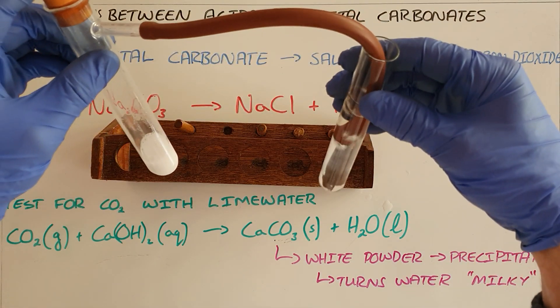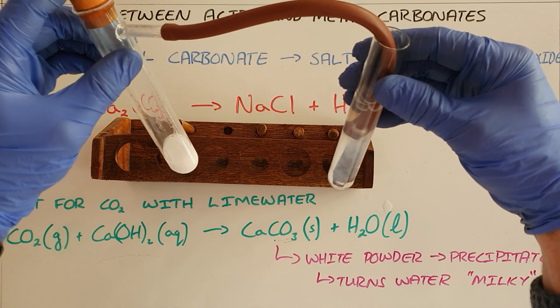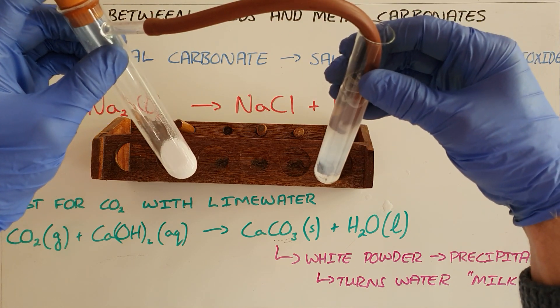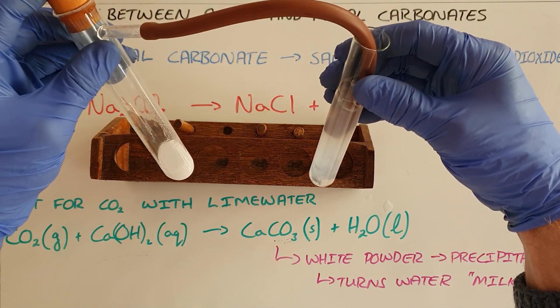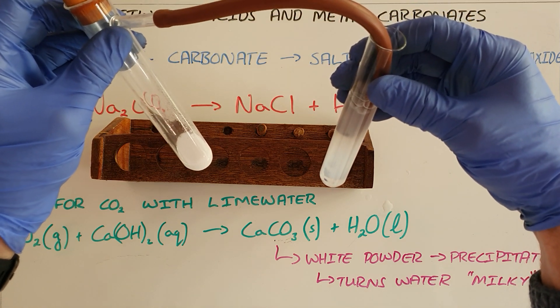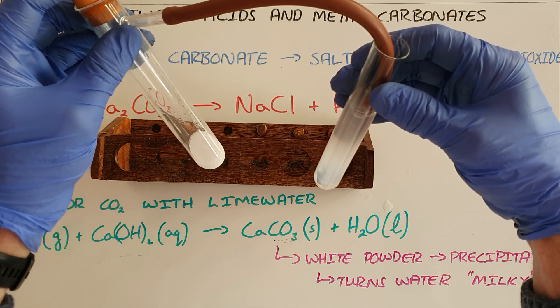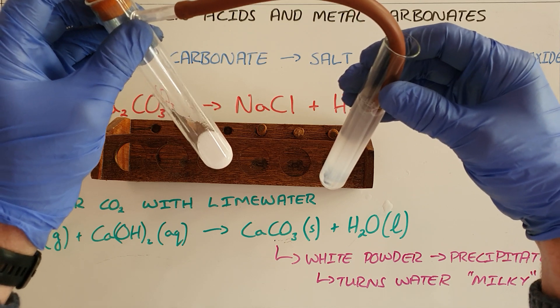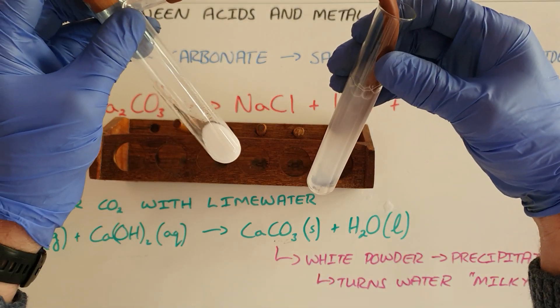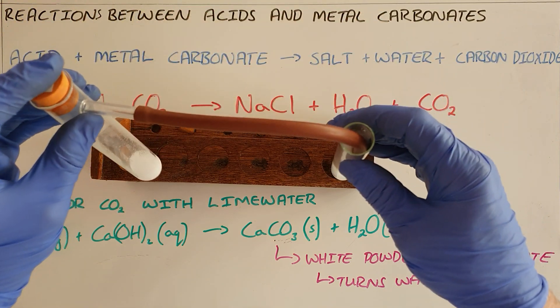We can immediately see bubbling happening in the lime water, and we can see that the lime water that started out clear immediately starts to turn a milky colour. That is the reaction between carbon dioxide and calcium hydroxide which produces calcium carbonate — the white powder we call a precipitate — that turns the initially clear water milky. We can now see that the reaction is starting to reach completion as the amount of gas released slowly decreases, but we can very clearly see that this water has been turned milky, showing that we have successfully tested for carbon dioxide.